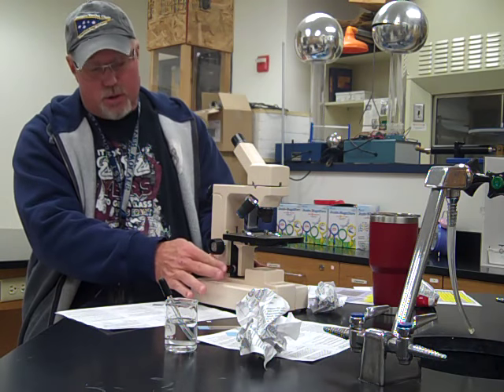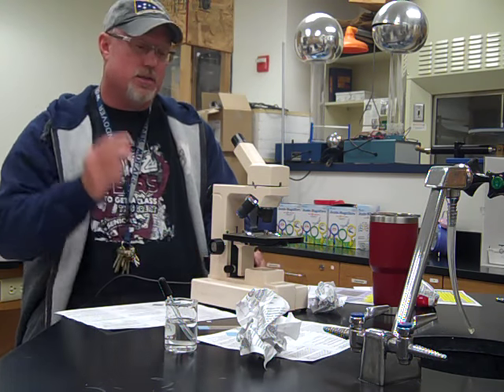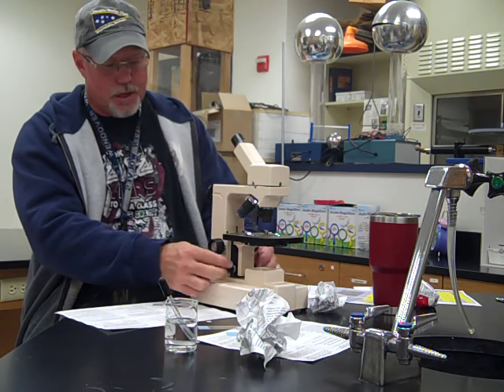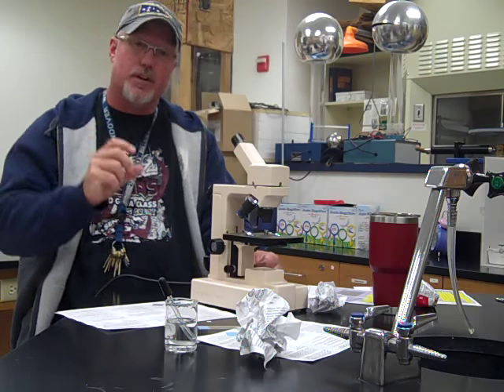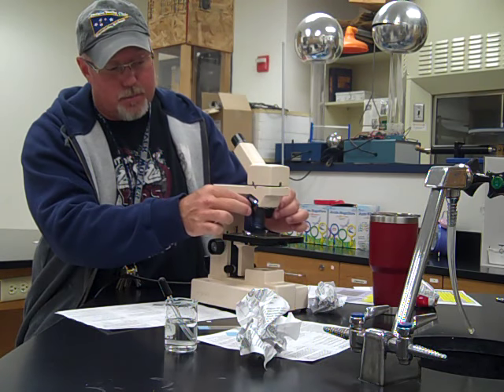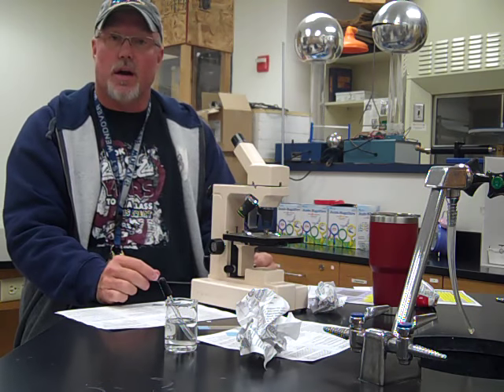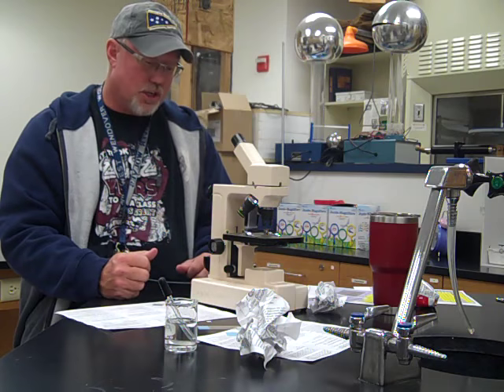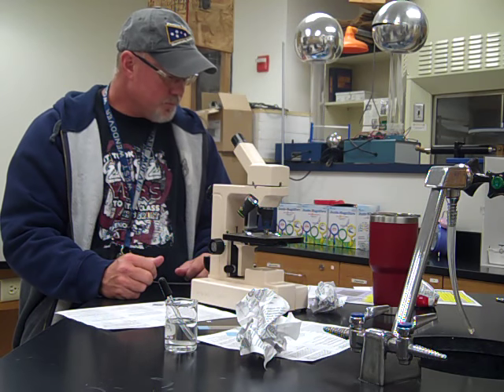The next one below it is the smallest one. This is what we call our fine adjustment. This moves your stage very, very slightly, but you only have to move it a little bit, and you're going to use that a majority of the time when you're on high power. So those are what you focus in on. We call those adjustments as you go.